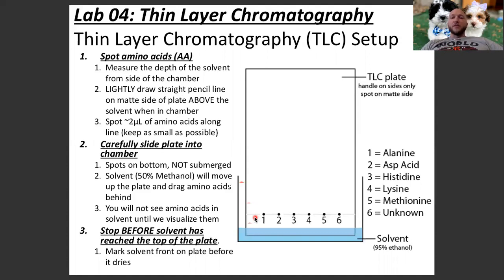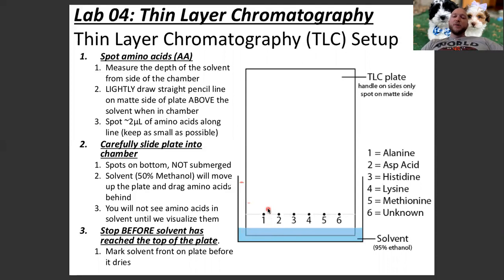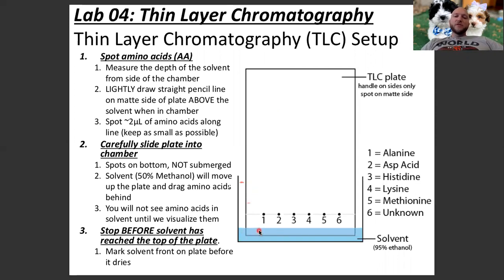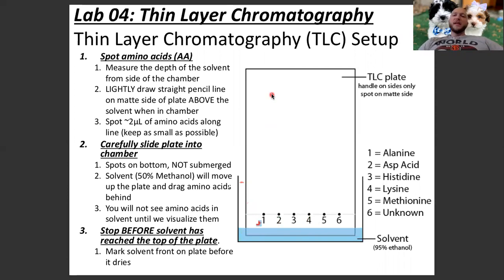During those two hours, the solvent moves up the plate. When the solvent comes in contact with our amino acid samples, it pulls the amino acids up the plate with it. This is similar to dipping a paper towel in water — the water moves up the paper towel. The ethanol and water solution moves up the TLC plate the same way, carrying the amino acids with it.